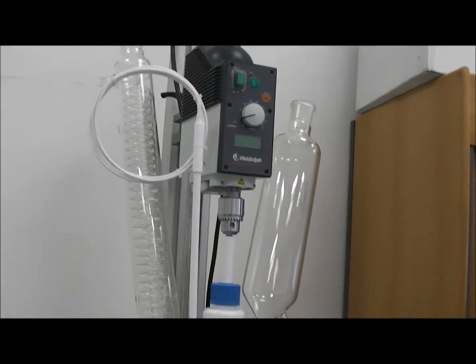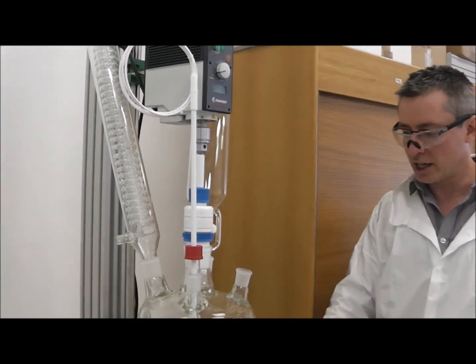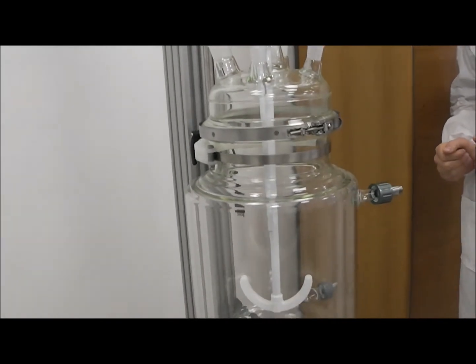Typically we can go up to about 70 litres. So what do you get with the system? You get the stand, the jacket, the lid, the kind of ports that you want, overhead stirrer, and then obviously the ability to connect to a circulator as well.